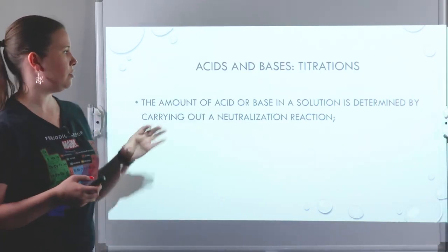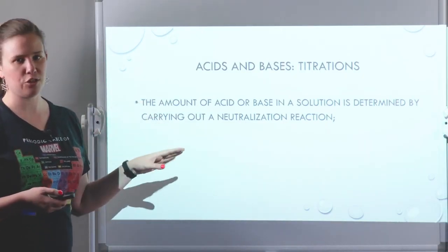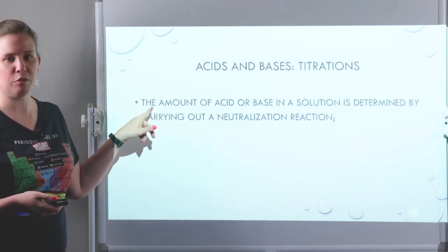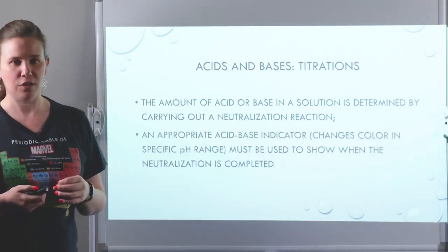Basically, we want to take some set amount of acid or base and carry out a neutralization reaction. It's actually important that I know the volume of both the acid and the base in order to get all the data I need for this calculation.